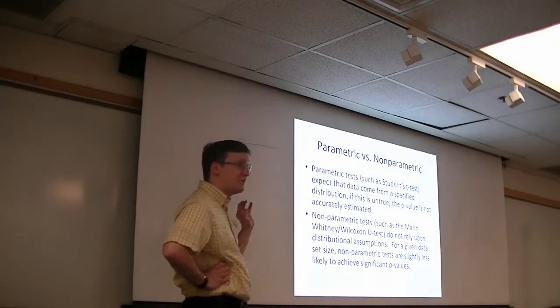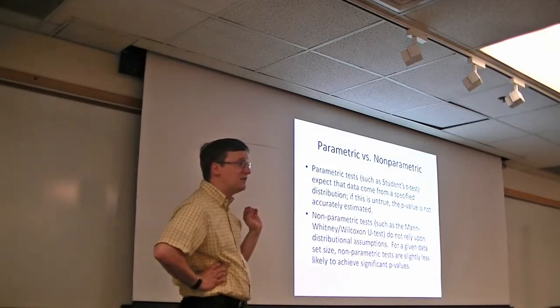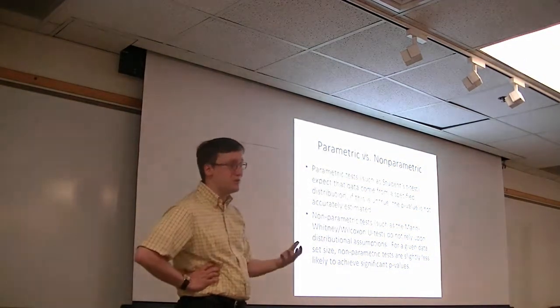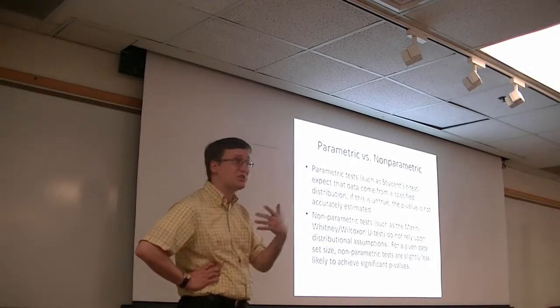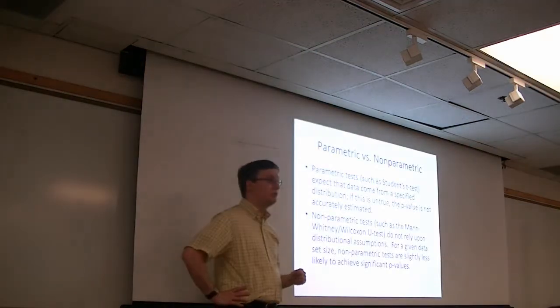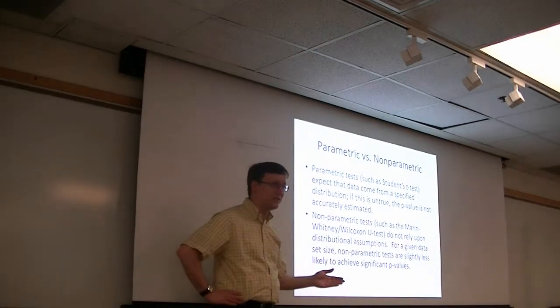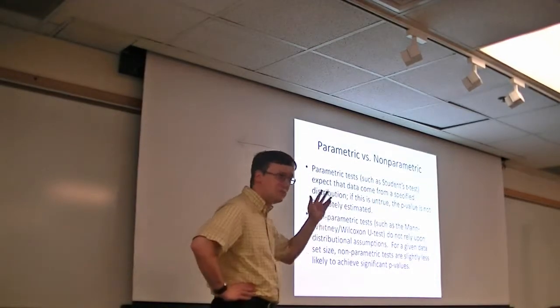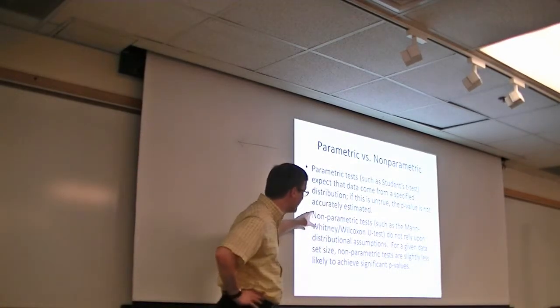Non-parametric tests can be quite good, and even better, most of them don't come with as many expectations or assumptions about the underlying data as parametric tests do. So lots of people have heard of the t-test. Has anyone in this room not heard of the t-test? Okay. The t-test is very well known, and that is good.